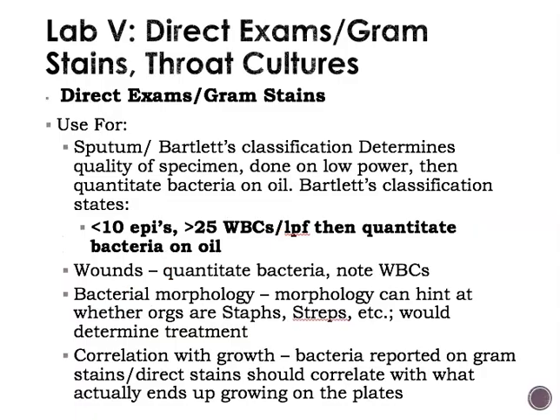Okay, last little section here is on direct microscopic smears or gram stains and then throat cultures. So direct exams, which can also be gram stains, come directly from the patient and go directly to the slide for observation. What you're seeing on the microscopic slide might contain tissue, cells, bacteria. And again, just like the gram stain when we talked about it earlier, the purpose of this is to predict what should grow on the plates.